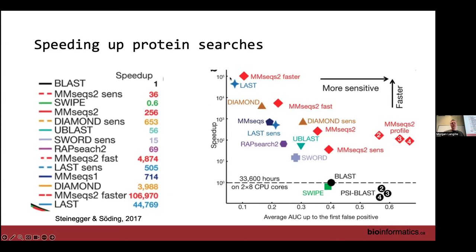So if we talk about metagenomic annotation systems, we'll start with systems where you just load your data up into a web browser and you get back data. Those do exist. Often these are also tied with databases that host the data. An example is MGnify, which comes from the EBI metagenomics server. EBI is a large sequencing group in Europe, and you can basically host your data there, and they'll do some annotation on it, including taxa and function, and give you back reports.